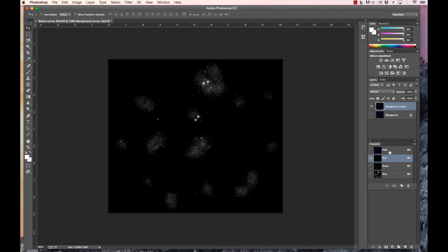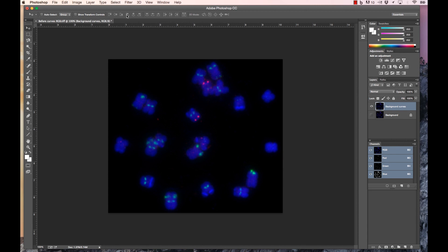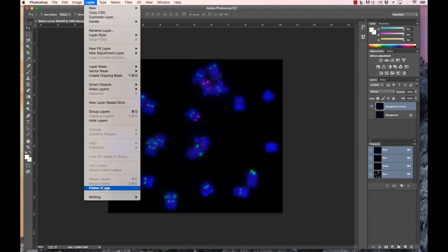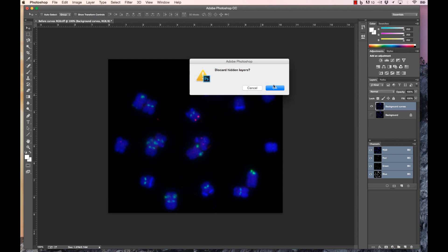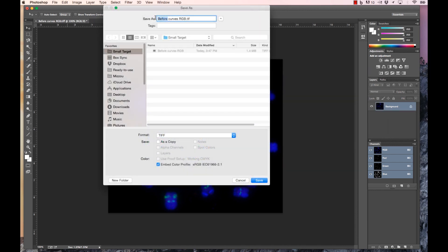To save the changes, the original layer is deselected. All channels are made visible and the image is flattened. The original layer will be discarded. Both the original and modified images are saved.